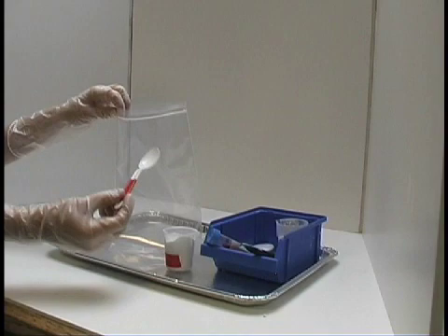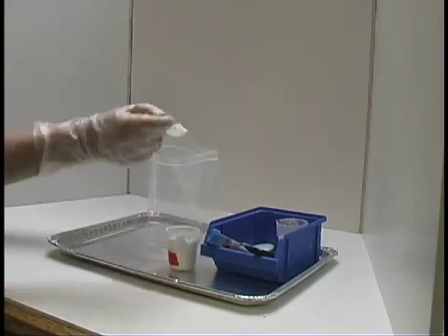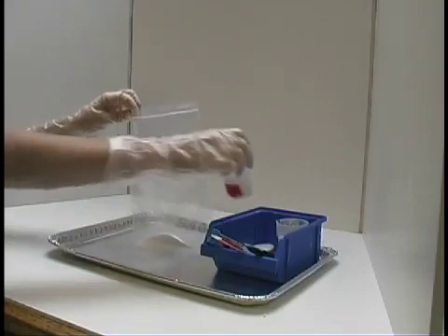Put on your gloves and goggles. Over the tray, open a bag, and put in one spoonful of baking soda and two spoonfuls of calcium chloride.